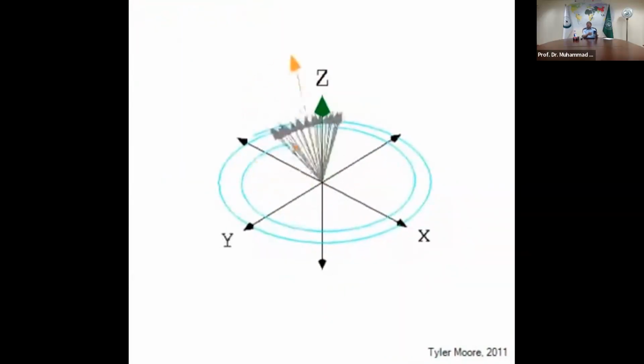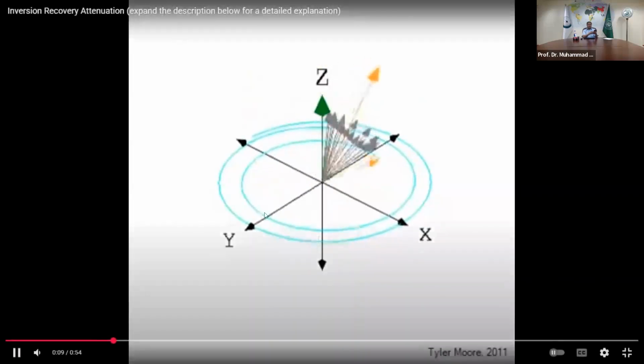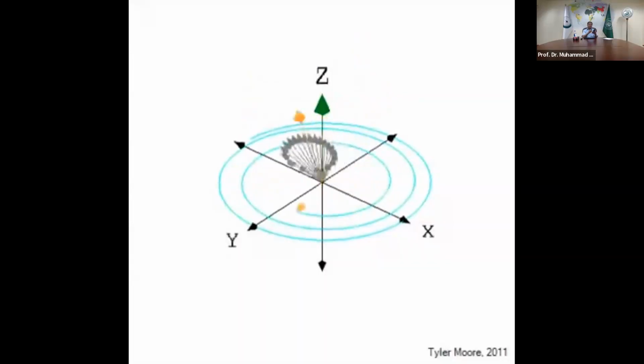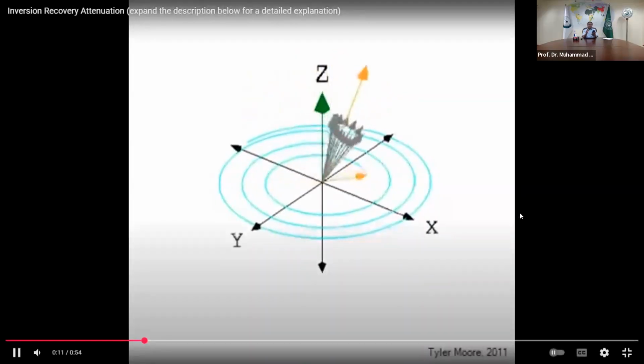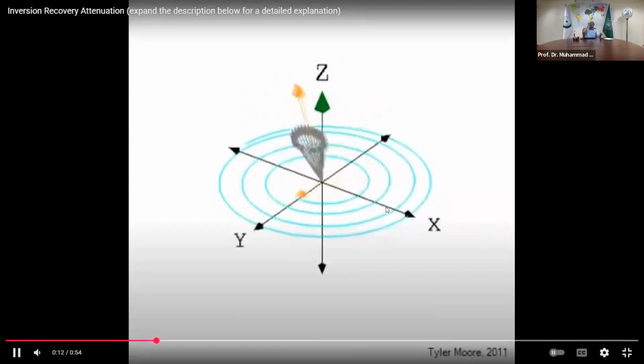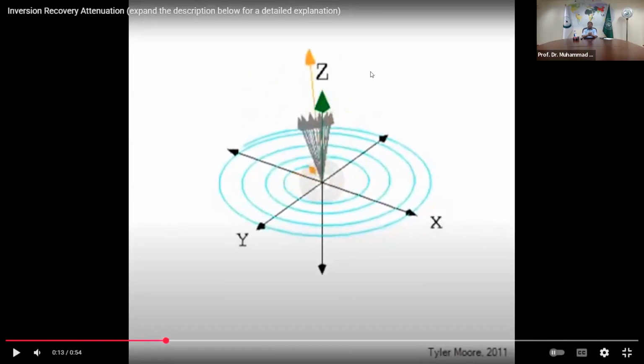Okay. Now my colleagues will explain to you about the probes, and the probe which they have in front of you is generally in the range of about 100,000 USD. So the one which you will see in front of you is about $100,000.